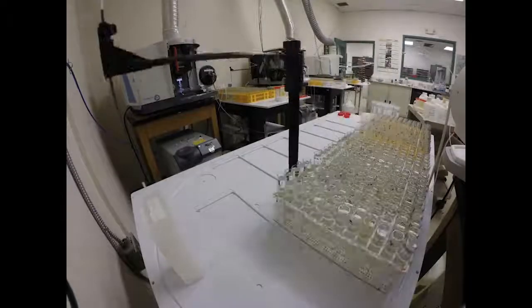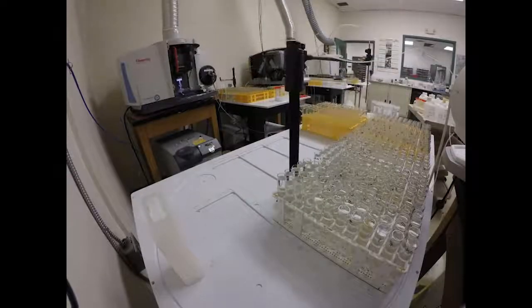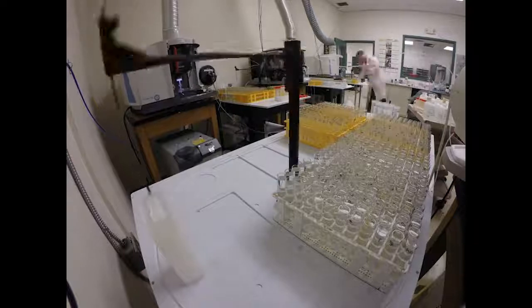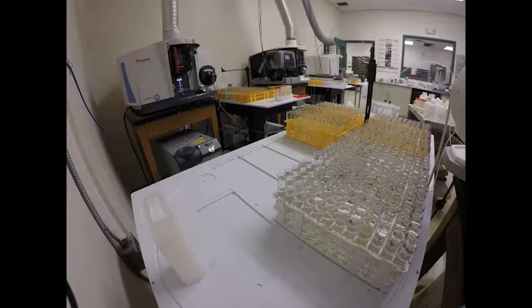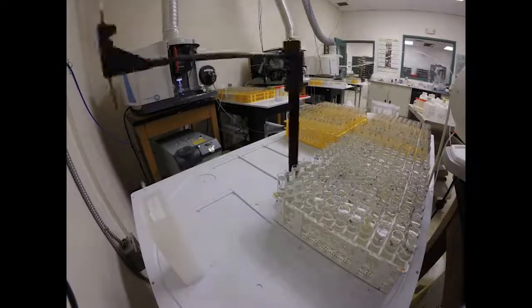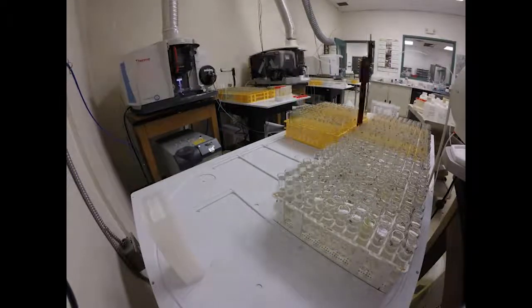Here in one of our analytical labs, sample extracts from the extraction lab are measured for nutrient concentrations. Computer-controlled auto-samplers pick up a small amount of sample extract and the measurement is done. These measurements are then transferred into our LIMS database where the data is later placed on the final report to the agronomist.